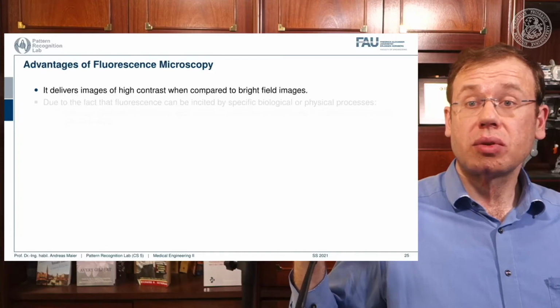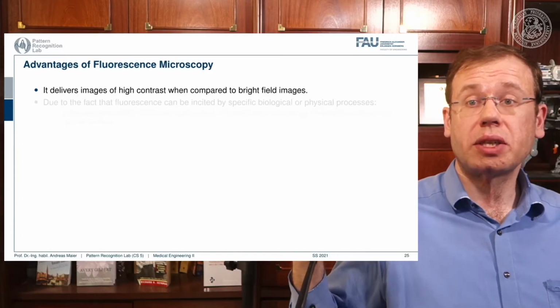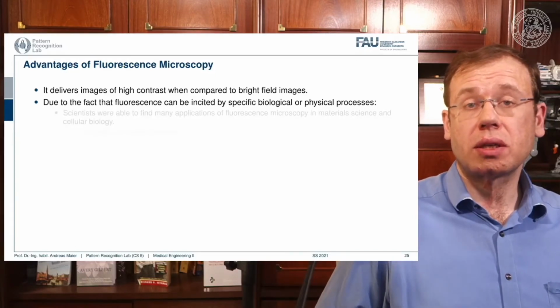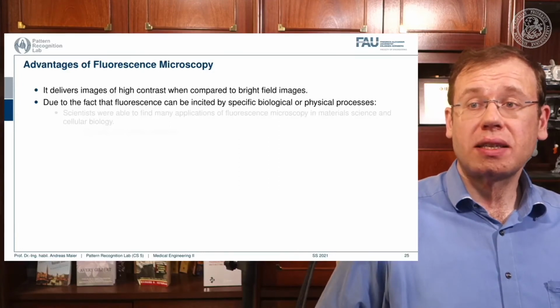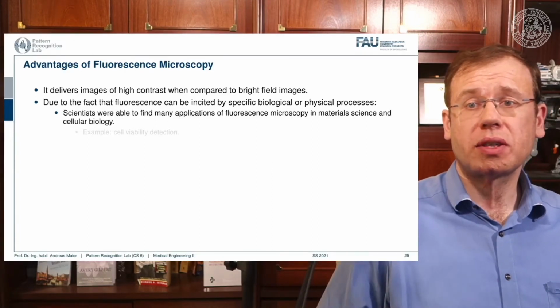So this can be used. It delivers a very high contrast when compared to bright field images. But the fluorescence effect has to be associated to a material. So it can cause additional biological and physical processes. So we end up with something that is called the observer's paradox.